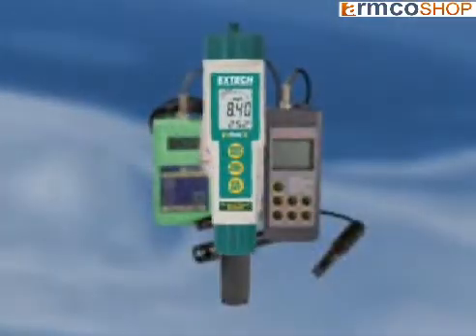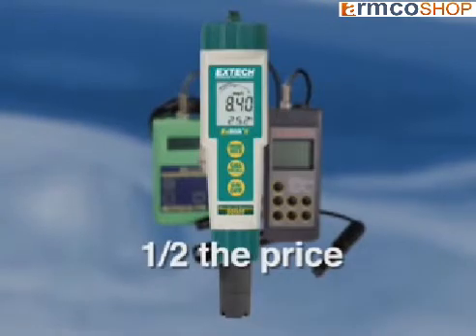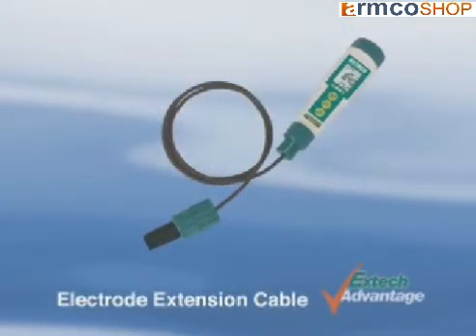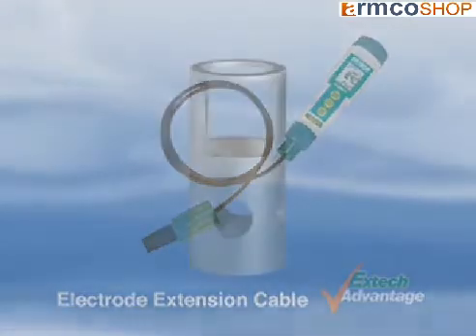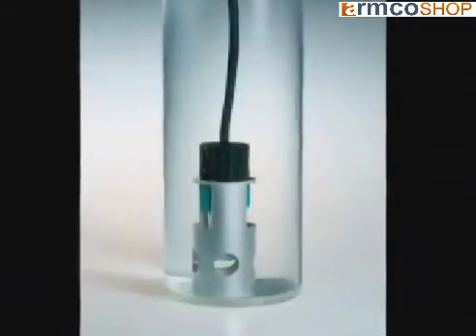So why pay more on a handheld DO meter when you can buy a stick-style dissolved oxygen meter at a fraction of the cost? Optional extension cables of 1 meter or 5 meter allow for measuring in difficult-to-reach areas. A weight keeps the electrode submerged while taking an underwater measurement.